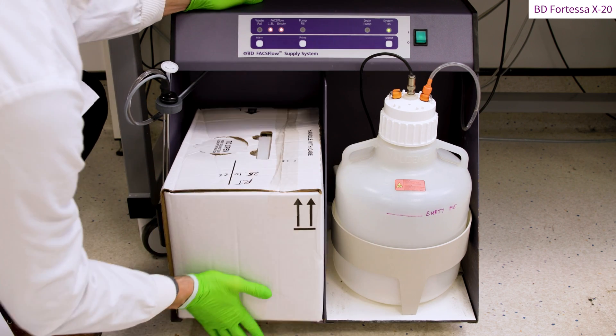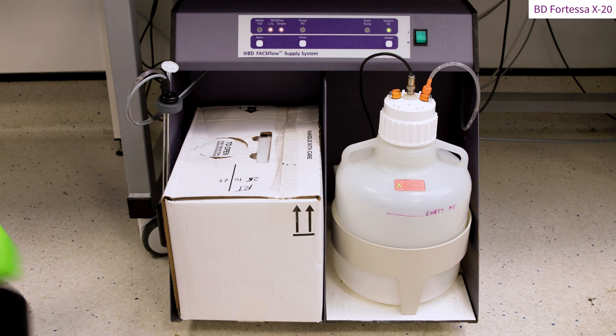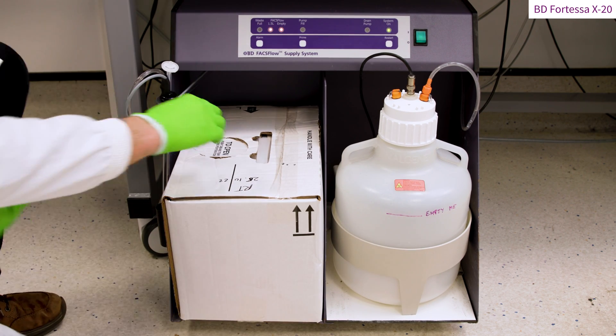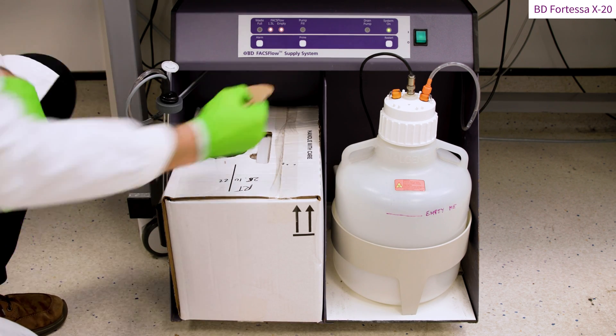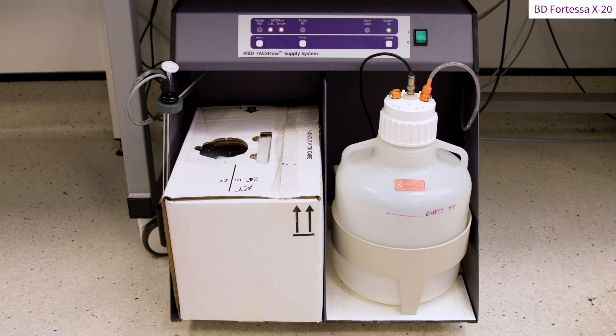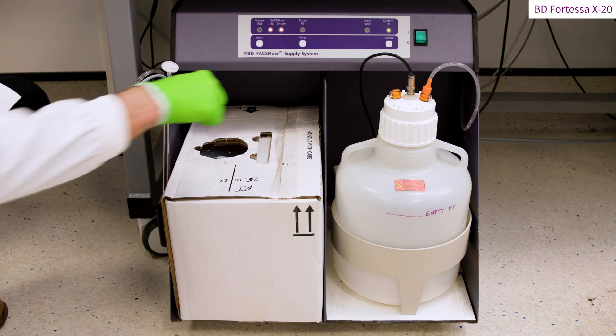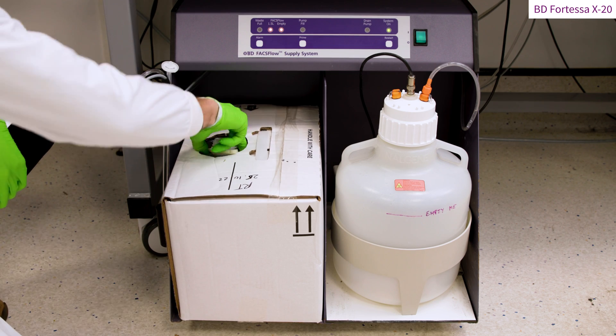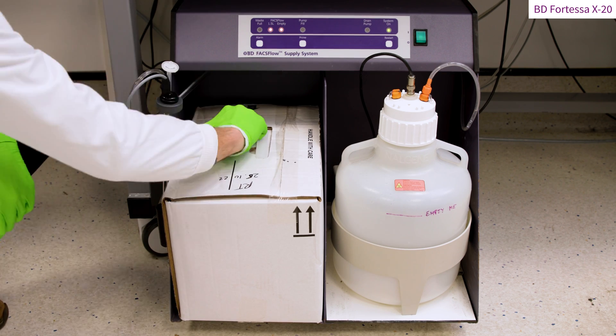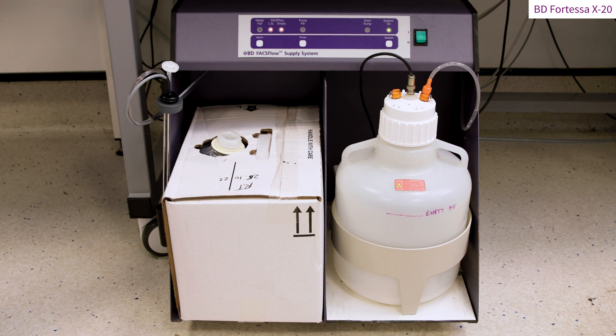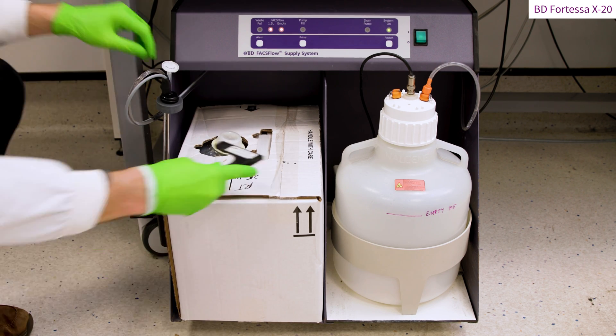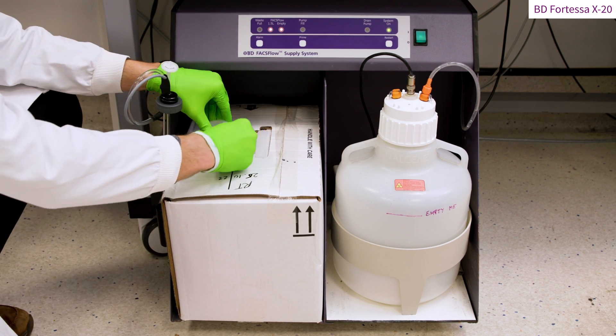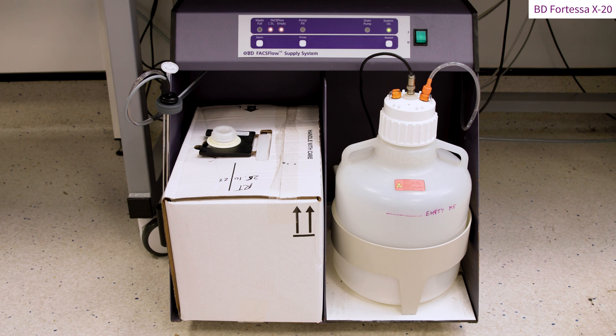To connect the new sheath fluid tank, place the new FACSFlow container on the fluidics cart. Remove the cardboard cap, lift the container aperture and secure it with the container neck holder.